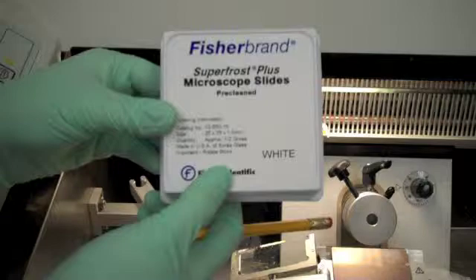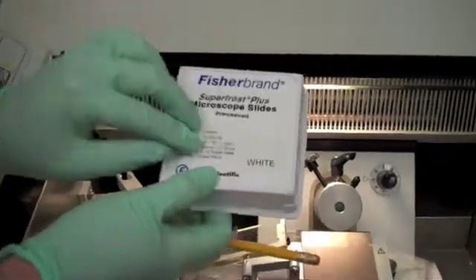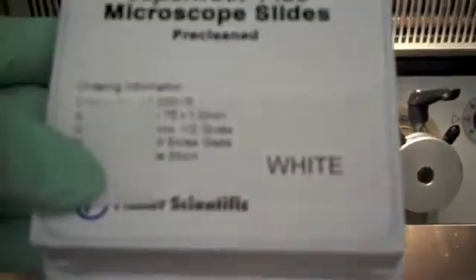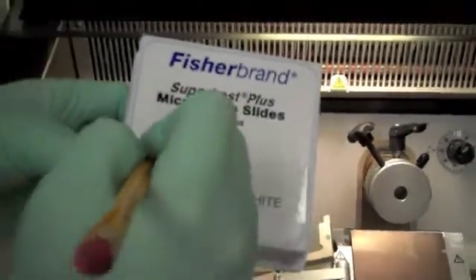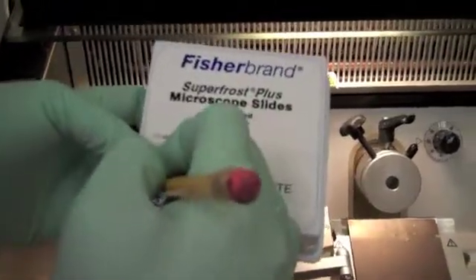You will be using Superfrost Plus slides for your sections. These slides are slightly charged so that your tissue does not slide off during any staining procedure. Label the slide and write down your initials and date at the bottom of the slide. Now you are ready to cryostat.